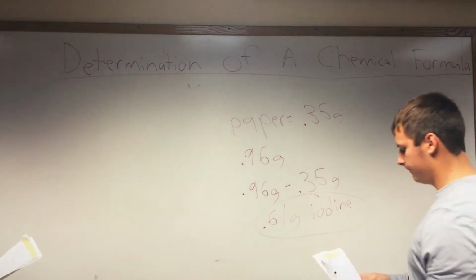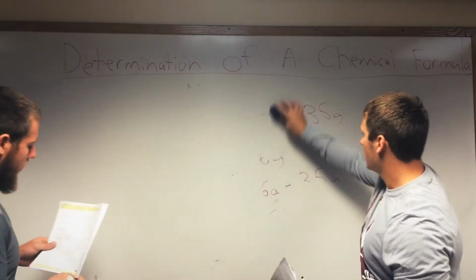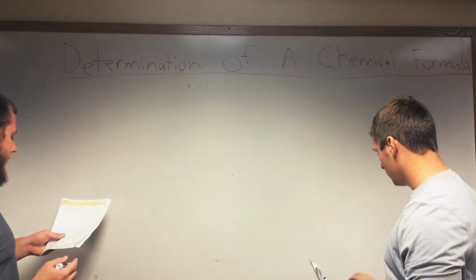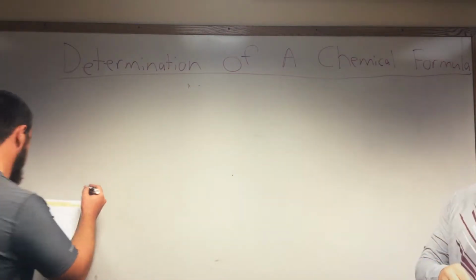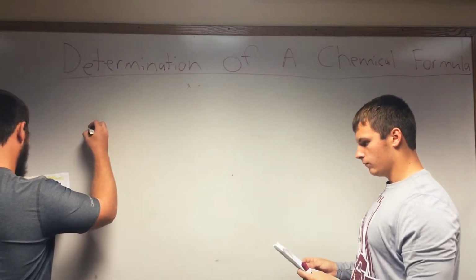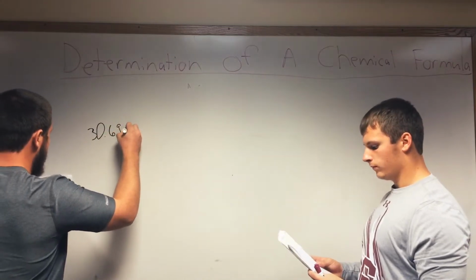That's how we got that. Then after that, we heated it, and the mass of the beaker and the zinc was 30.69 grams.